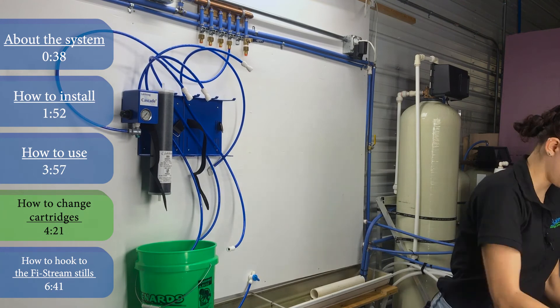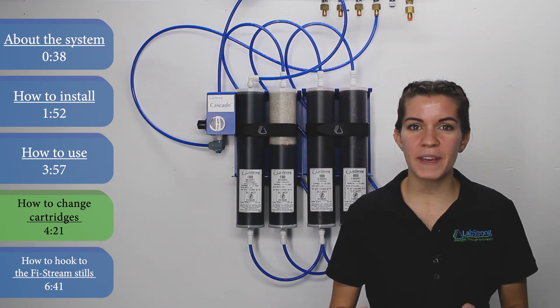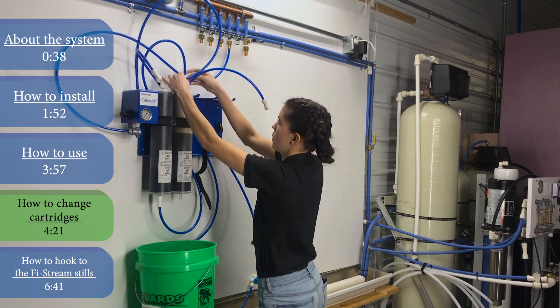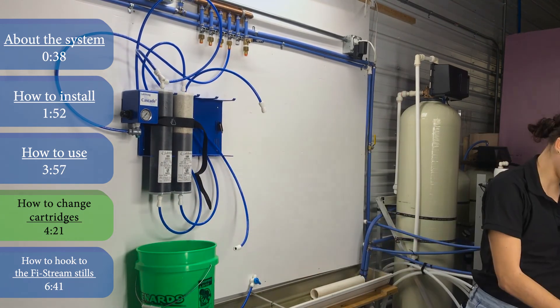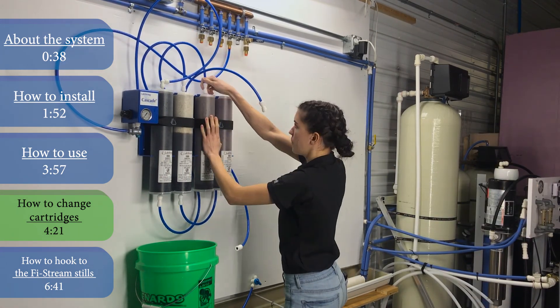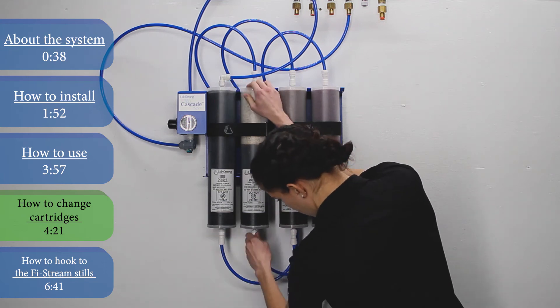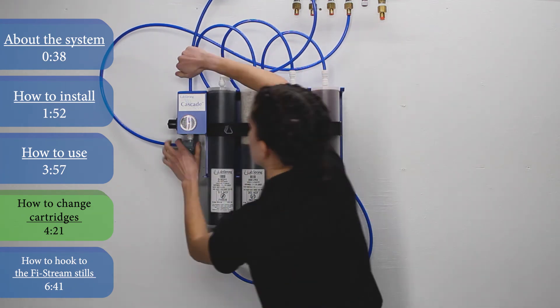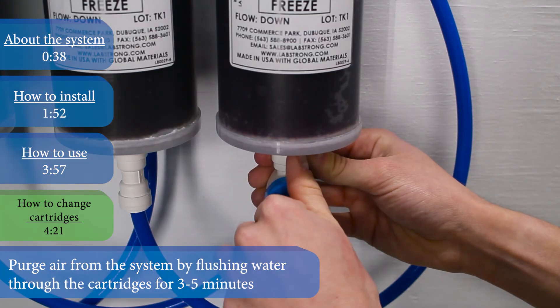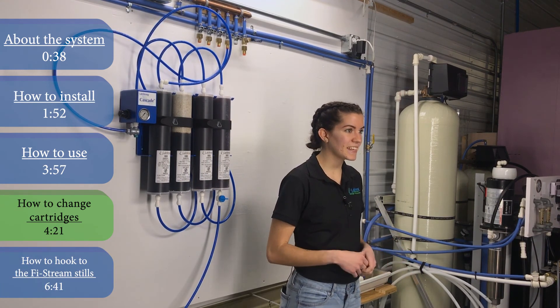Now we can install our new cartridge kit — today we're using the D00299KT cartridge kit. Install your new cartridges, making sure you're placing them in the proper order according to the directions that came with your cartridge kit. Tighten the straps to lock the cartridges into place, then attach the appropriate fittings to the top and bottom of each cartridge, listening for the snap to know that each one is securely locked into place. Once that's complete, double-check that all of your fittings are secure, turn on your water source, then open the draw-off valve at the bottom of the last cartridge. Once that's done, close the draw-off valve, and after a final check of the system for any leaks, your Cascade system is ready to go.